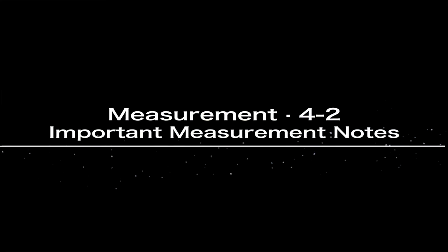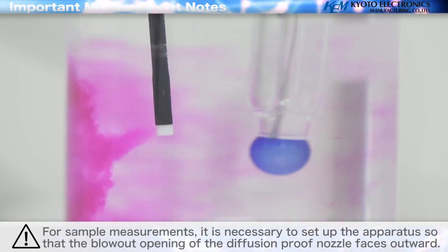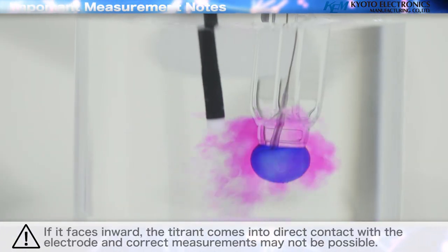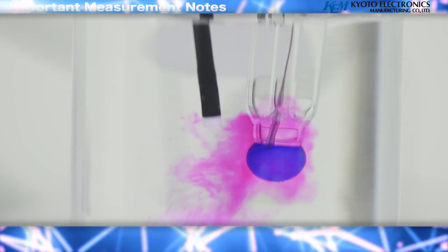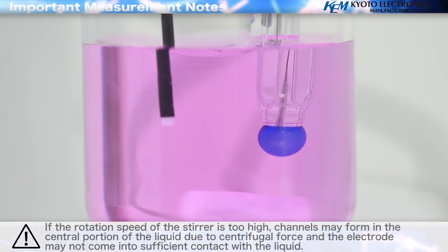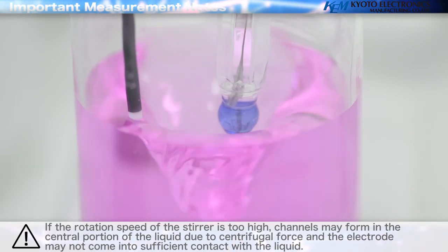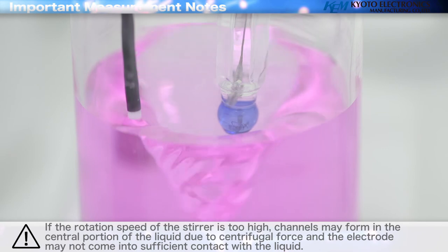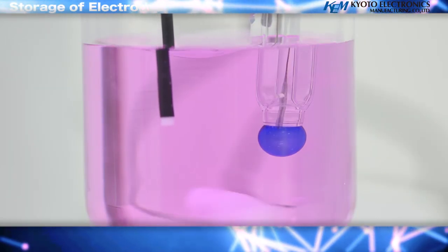Important measurement notes: for sample measurements, it is necessary to set up the apparatus so that the blowout opening of the diffusion proof nozzle faces outward. If it faces inward, the titrant comes into direct contact with the electrode and correct measurements may not be possible. If the rotation speed of the stirrer is too high, channels may form in the central portion of the liquid due to centrifugal force and the electrode may not come into sufficient contact with the liquid. Please adjust the speed with the knob.